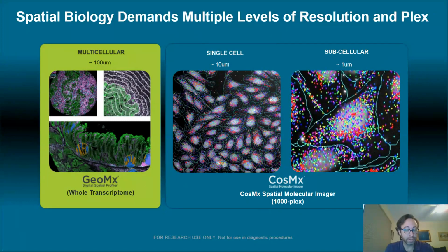So after you've done the immunostaining, you have the ability to control the segmentation process however you want. And by that, I mean you can segment on multiple different markers or on individual markers. So if you want to, say, look at a tumor that has T cells that are infiltrating through it, like is shown at the bottom of this figure below, you can collect tumor cell rich regions using pan-CK, but then use CD3 staining to exclude the T cells that have invaded, so that you can capture those in a separate segment.